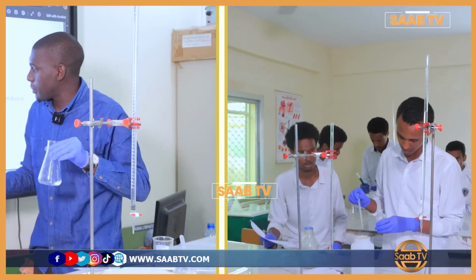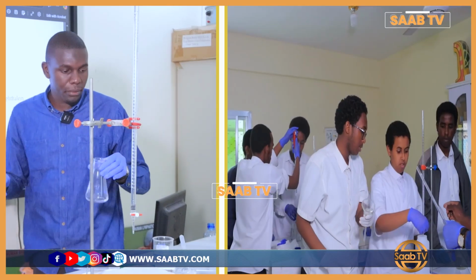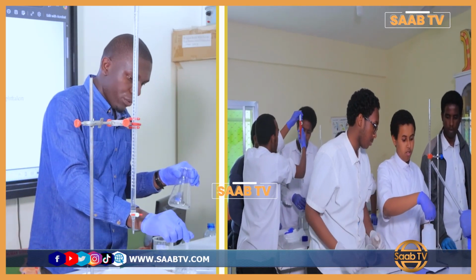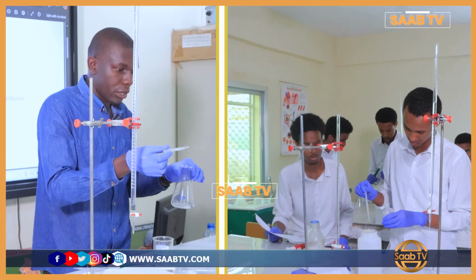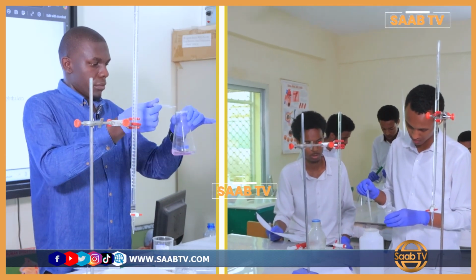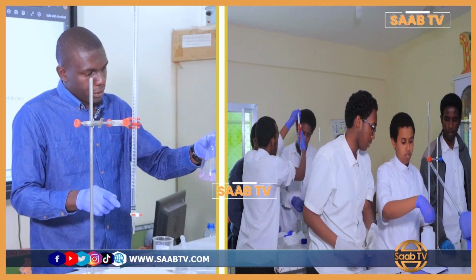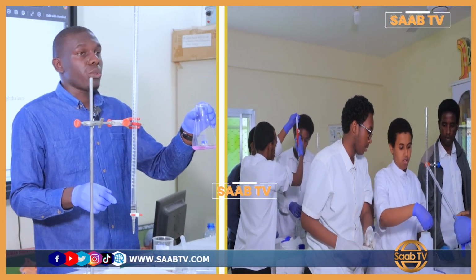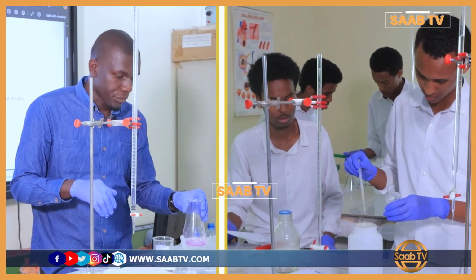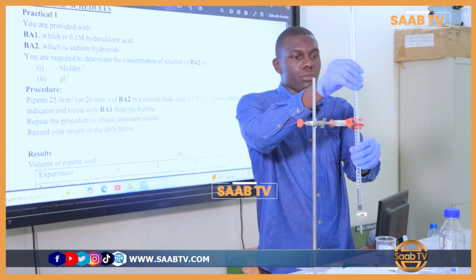So what will be the next step? Add 2 to 3 drops of phenolphthalein indicator. Everyone has phenolphthalein on your tables. So phenolphthalein is here, that is our indicator we're going to use. So I've added 3 drops. Now the purpose of the indicator is to show you the end point of the reaction when neutralization is complete. Is that clear? So after adding 2 to 3 drops of the indicator, then I have my burette over here.